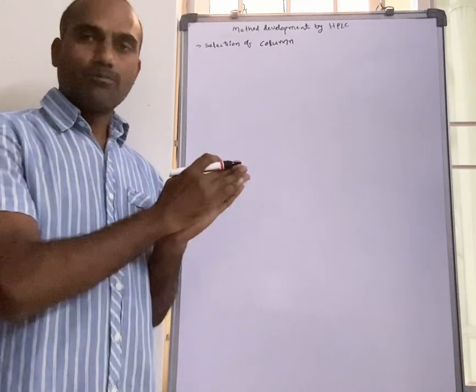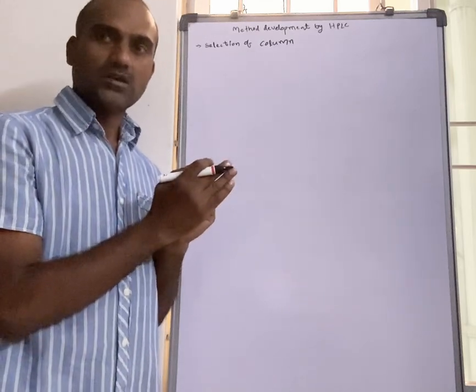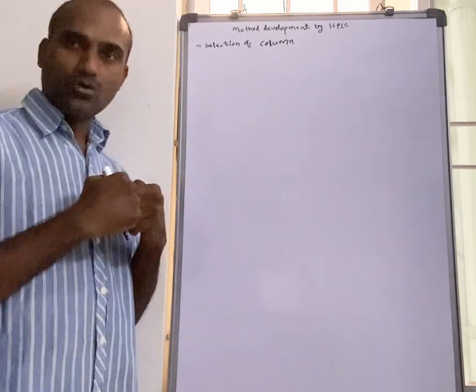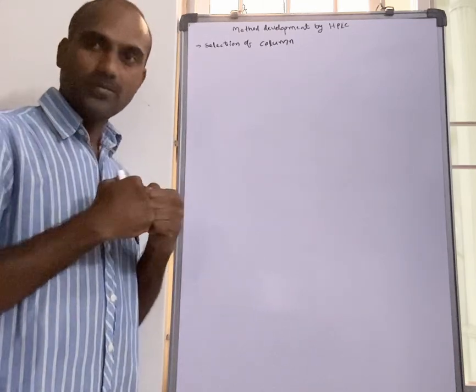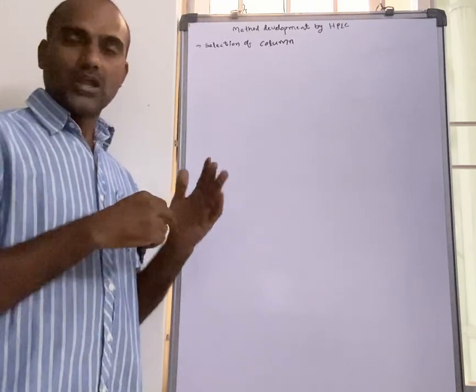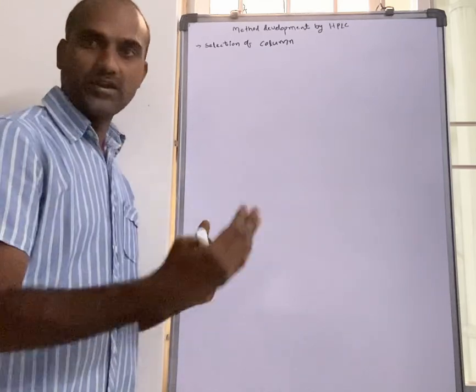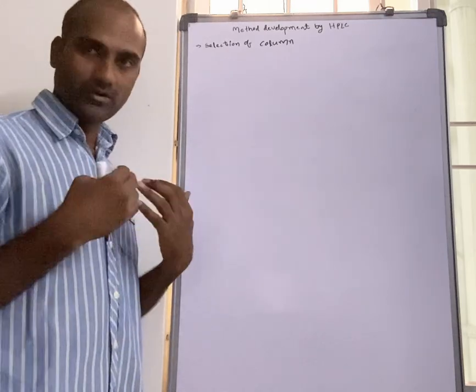If the molecule is non-polar in nature, the stationary phase should be non-polar in nature. Simple basic concept. Because non-polar affinity will be more and it will retain for long. Retention will be more and separation will be there. If you use opposite polarity, then there will be no affinity and it will elute very early. All impurities and main peak will elute at a time and there will be no resolution.